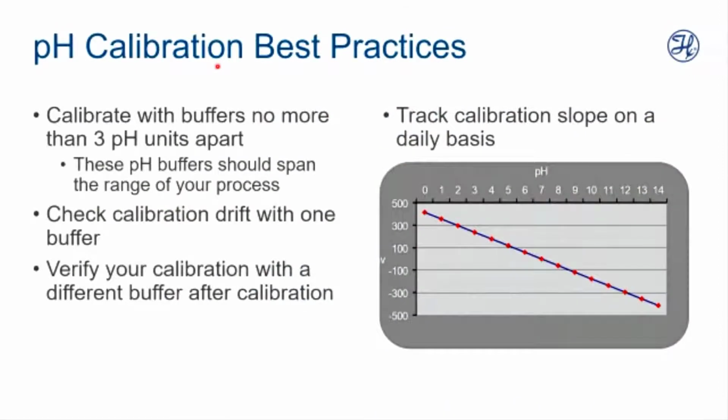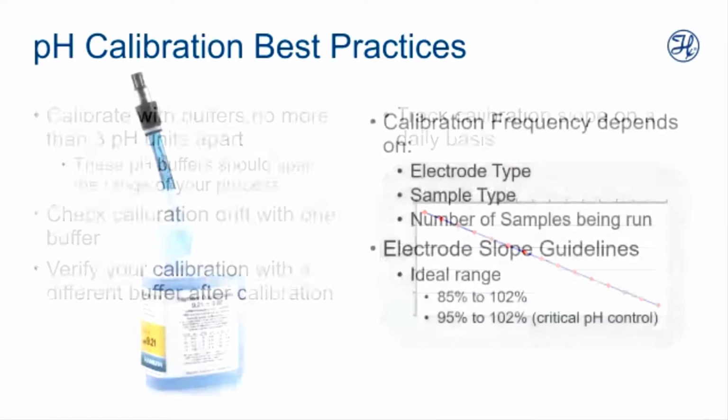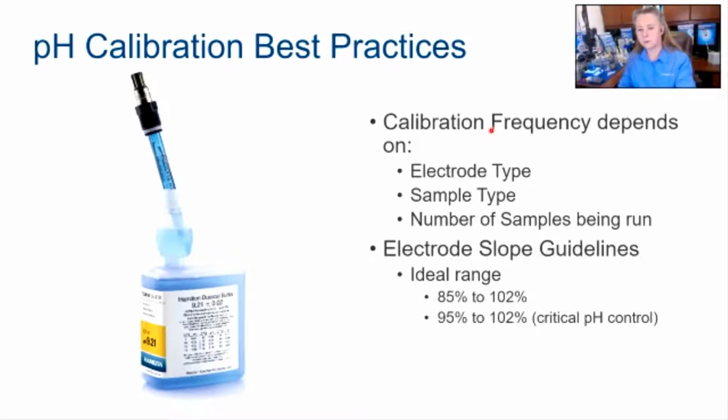Okay. Calibration and handling best practices. Track your slope every time you calibrate. Track your offset every time you calibrate. How often do you calibrate? Well, that's an excellent question. I'm glad you asked me.